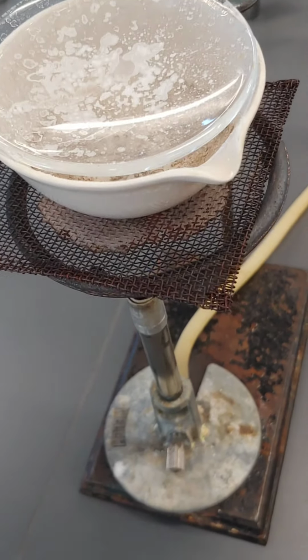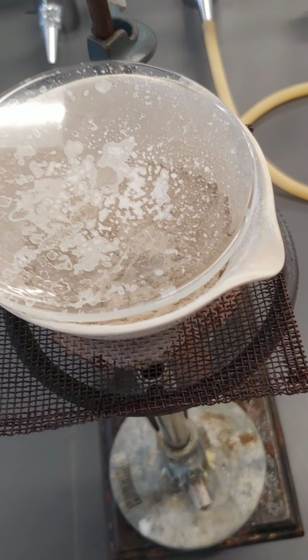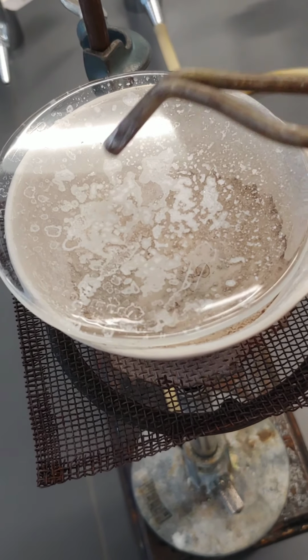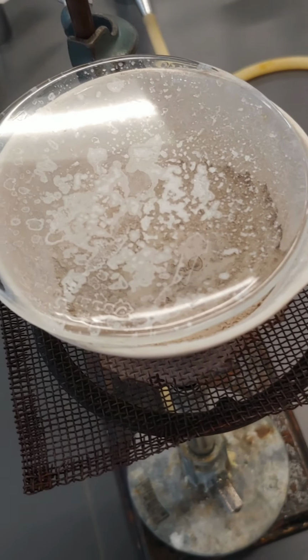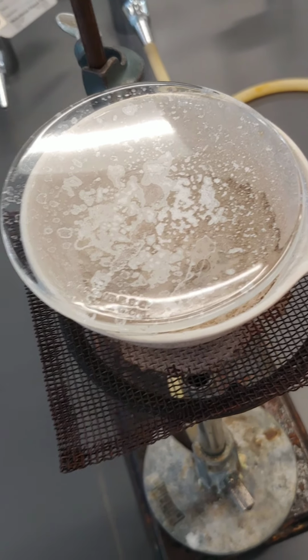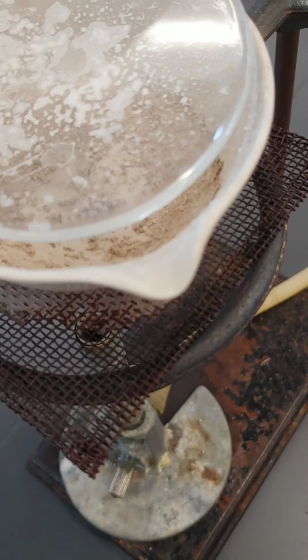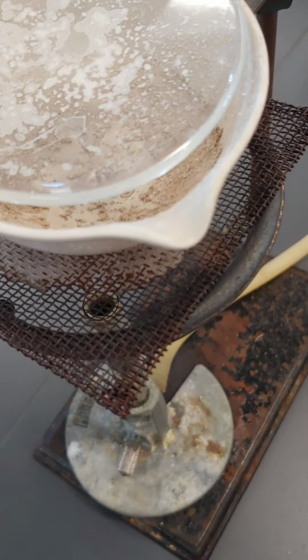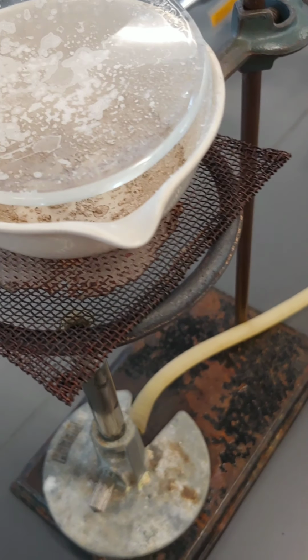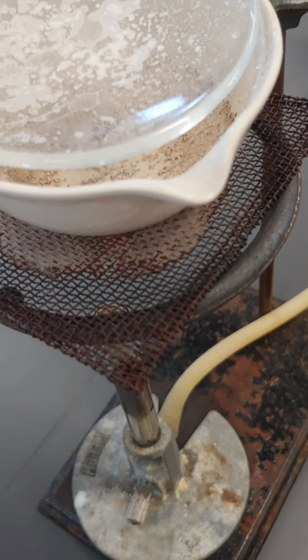As you can see, here is our dish with the watch glass on it containing our dried salt. And as I mentioned, you can see all the crusty salt that's splattered onto the watch glass. And again, if we hadn't had the watch glass, that mass of salt would have been lost. When we look inside the dish, just a couple observations, you can see that there's some coloring going on. Not sure what went on there, perhaps there was some contamination present either in the dish or in the sample, but you can see inside.